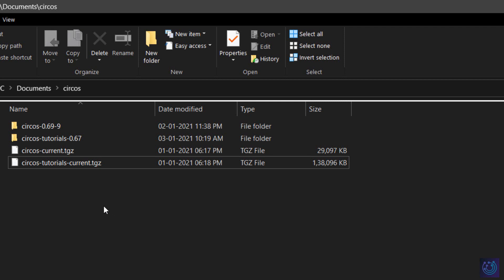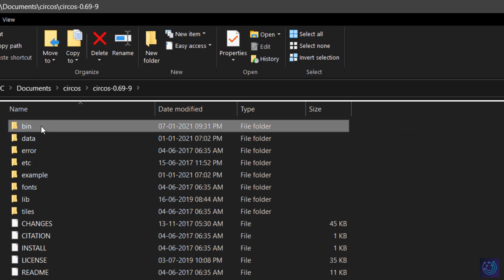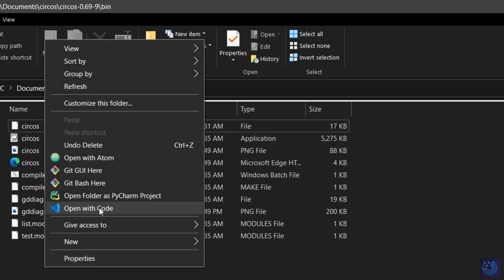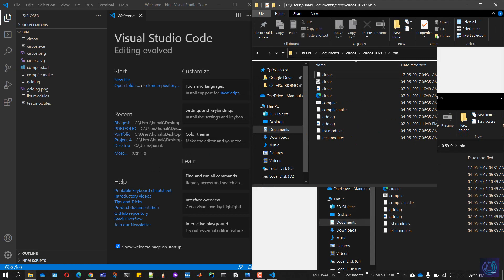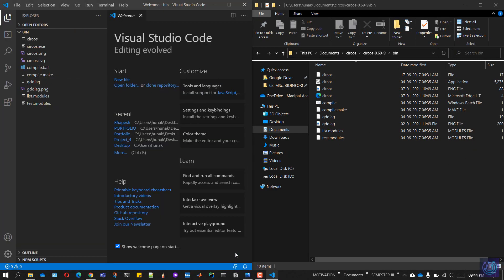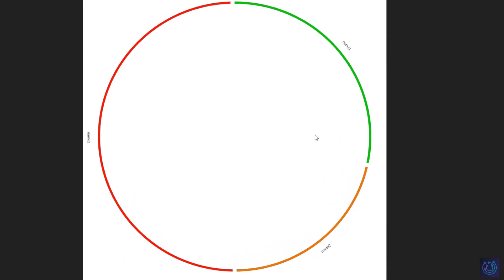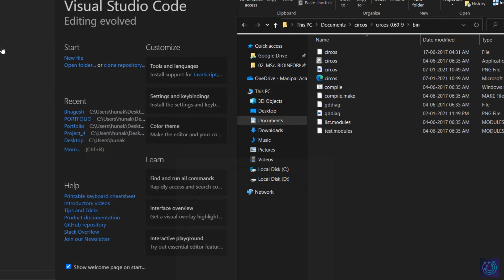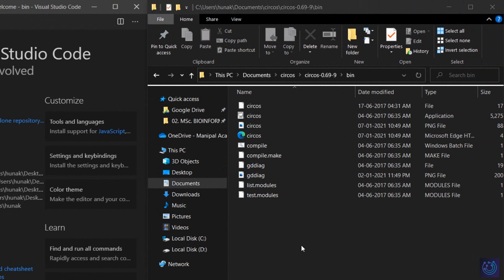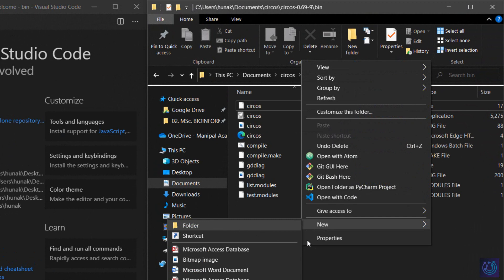Please check that out before watching this video. So let's get started — go to the folder Circos and to the folder bin. I'll be using Visual Studio Code to create and edit files; you can use basically any notepad or text editor app. Before we begin, let's have a look at what we will be building — we'll be constructing a circular plot like this by the end of this video.